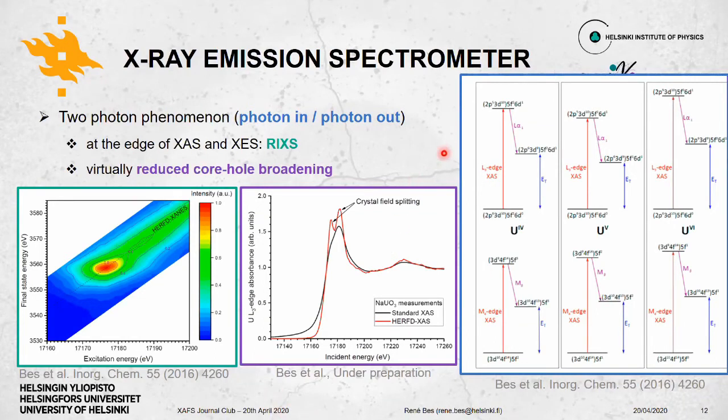Oh, great. Yeah, the idea is that what you've been calling self-absorption can be reduced. It's caused by the probe depth varying with the energy, so that as the sample gets more absorbing, you probe fewer atoms. And so if you use M-line emission, then it's the fluorescence that controls the probe depth, and therefore that gets rid of it.